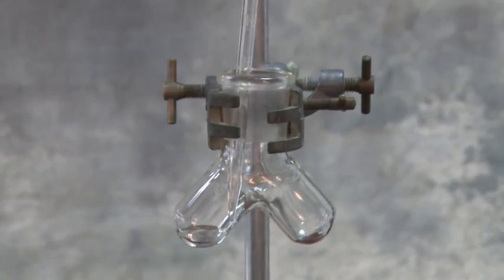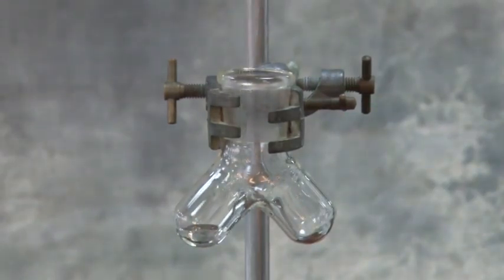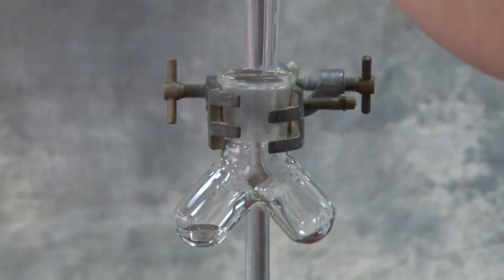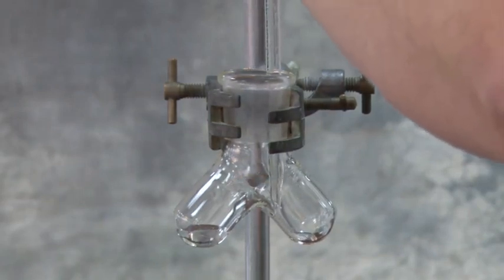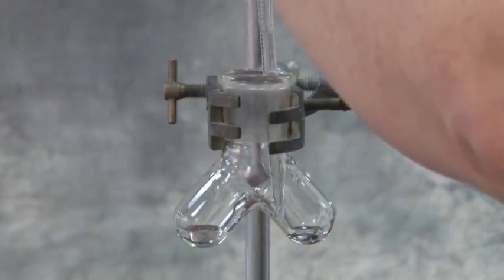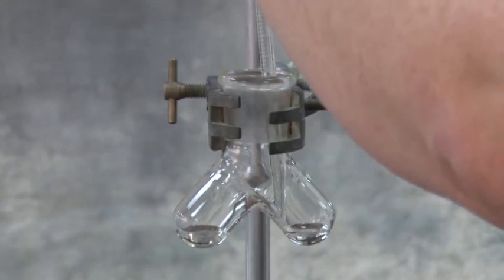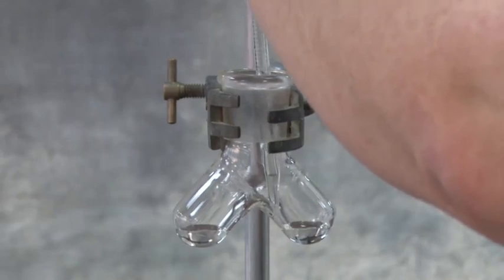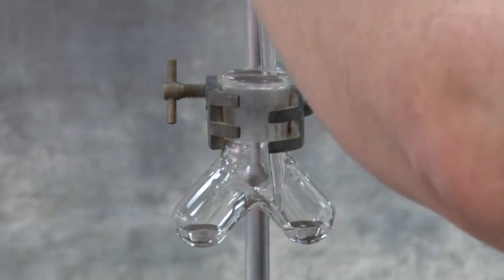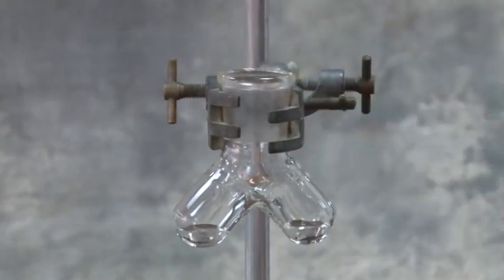Once that has been done, we can put into the other side our catalyst. In this case, this is going to be a potassium iodide solution. Again, 2 cm³ of the potassium iodide solution. We're going to make sure we get every last drop of that into the reaction vessel, being careful to keep the components, the catalyst and the reactant, apart at this point in order to prevent the reaction from starting, because things at the moment are not at the correct temperature to do the reaction.